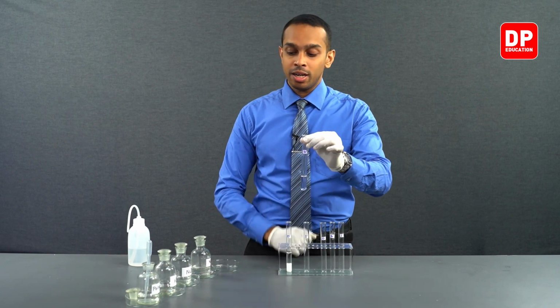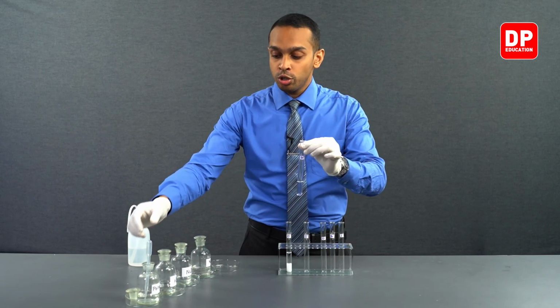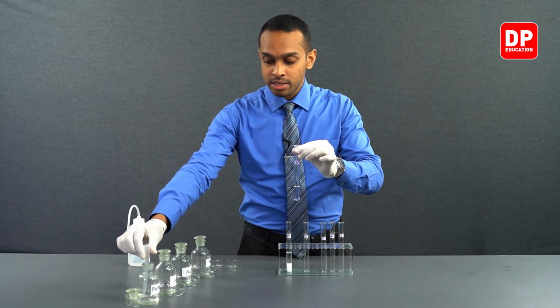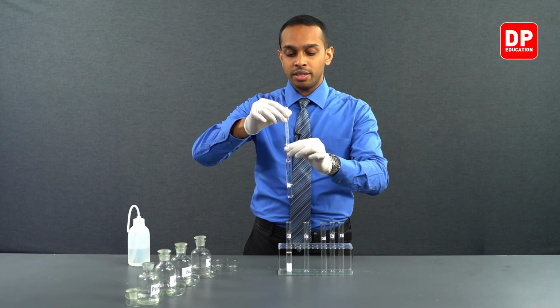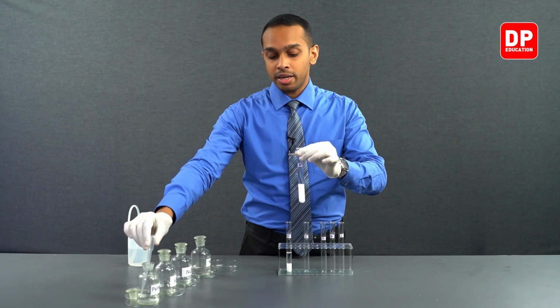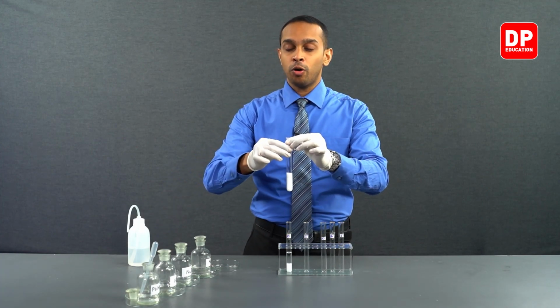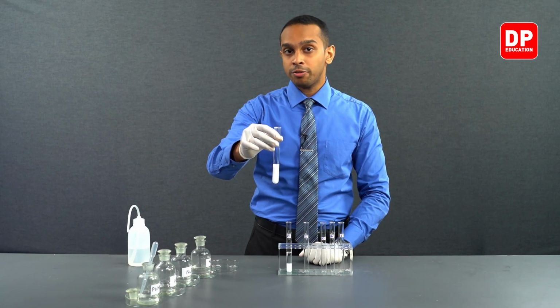If you add a little bit of lead nitrate into this, you will see the bromide ions present in this solution will react with the lead ions in the lead nitrate solution, and will form again a white color precipitate. It was quite a fast reaction.